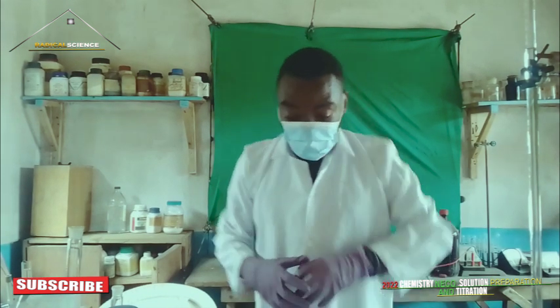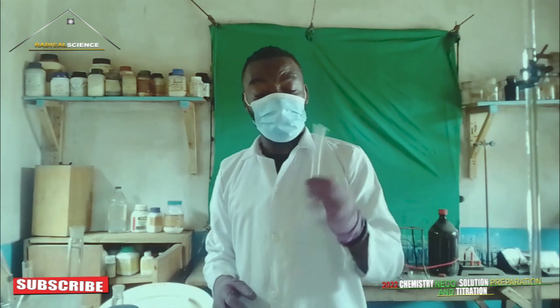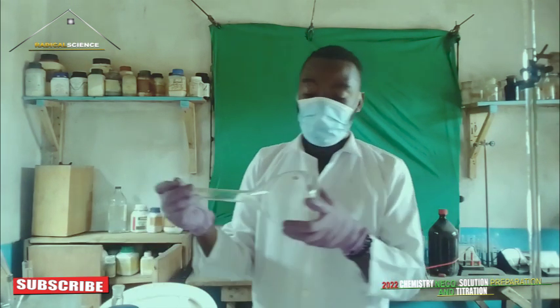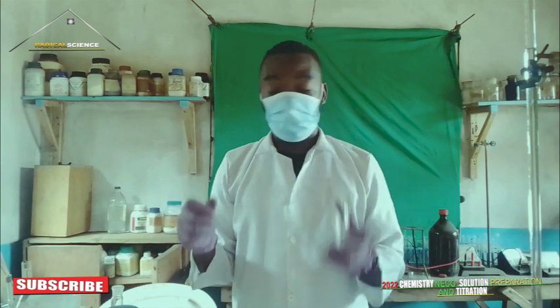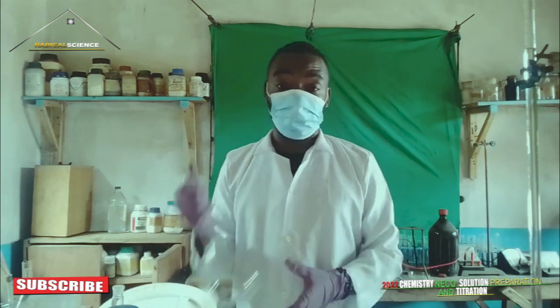What they are trying to say is that we should measure 9.5 cm cube of this nitric acid, then dissolve it in 1000 ml, which is equal to 1 dm cube. My advice to you is do not use any other container in measuring, just use this one.